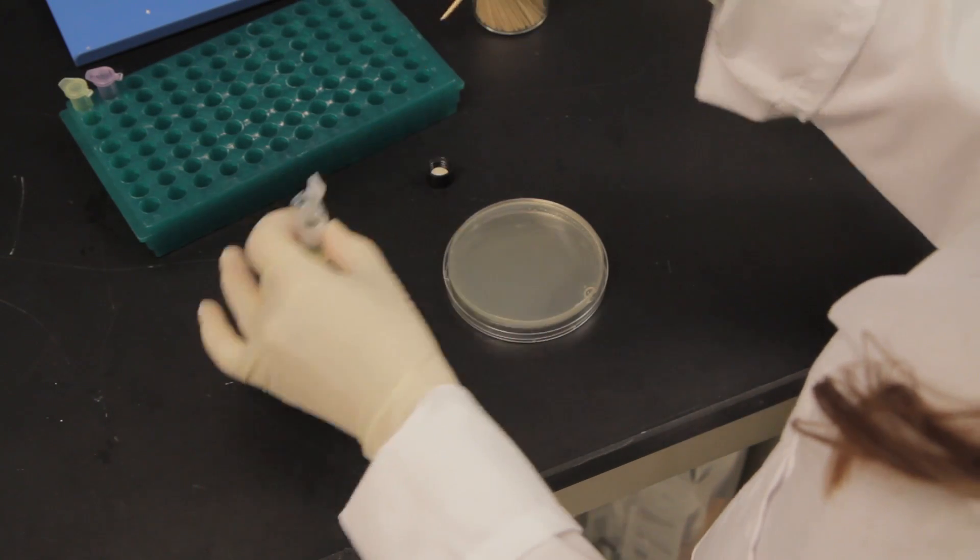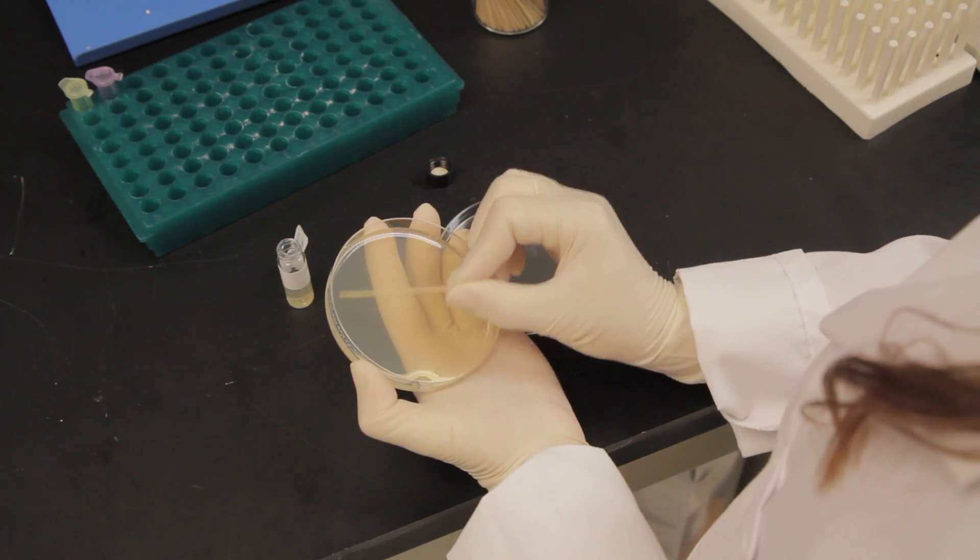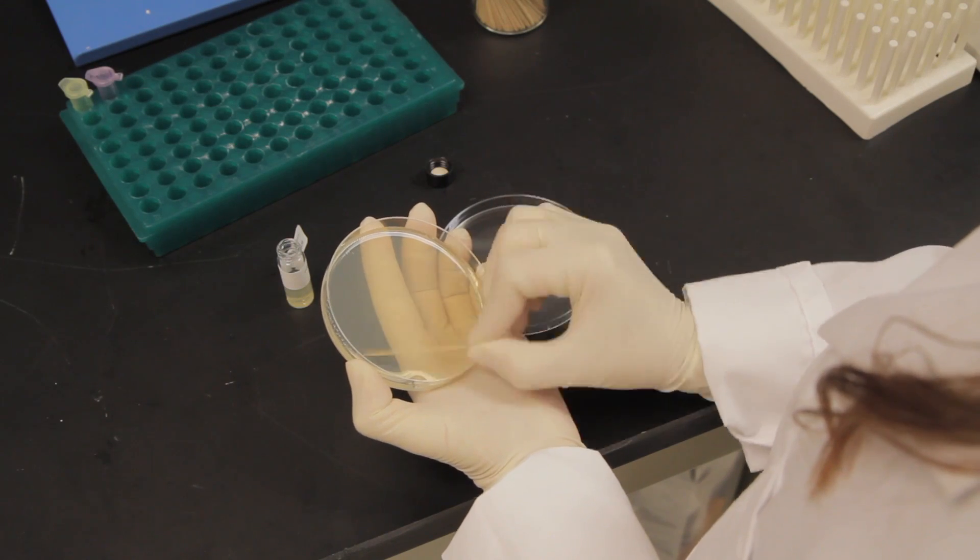Within 2 weeks, you should streak the bacteria for single colonies on an antibiotic-containing agar plate.